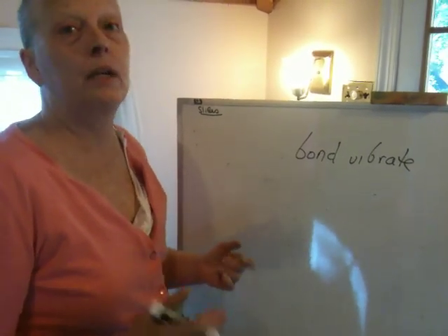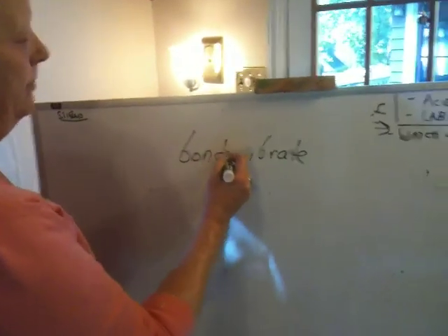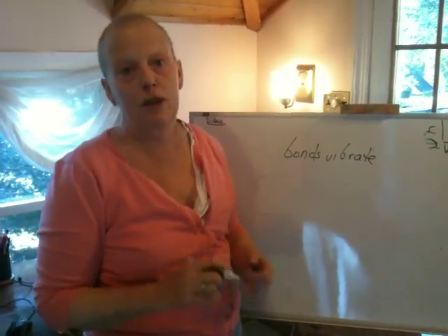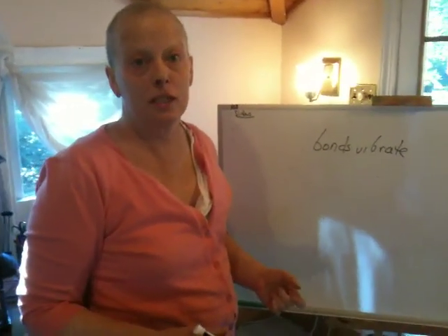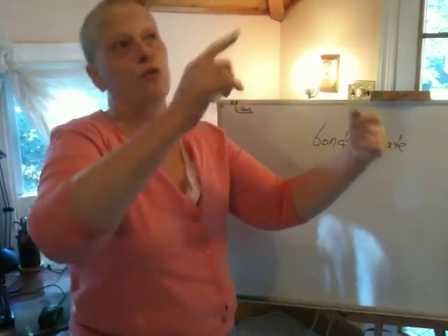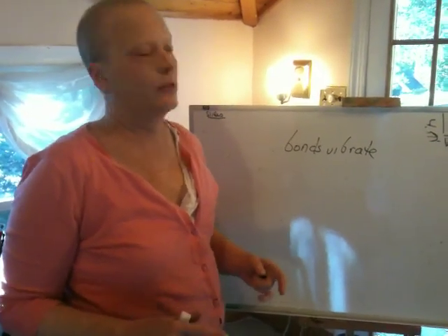So for the first time this week, we're going to have some information about the structure of the molecule and not just circumstantial evidence, which is what we've had so far. So bonds vibrate. And what I mean by vibrate is that they stretch, kind of the way I'm moving my arm, and they bend. I'm going to talk more about that in a minute. But they stretch and they bend at characteristic frequencies. So this must be really exciting to you, because in class, these last weeks, you've been learning that bonds rotate. They're just rotating all the time, and then they sit in preferred conformations. Well, they also vibrate all the time, and they vibrate at characteristic frequencies.